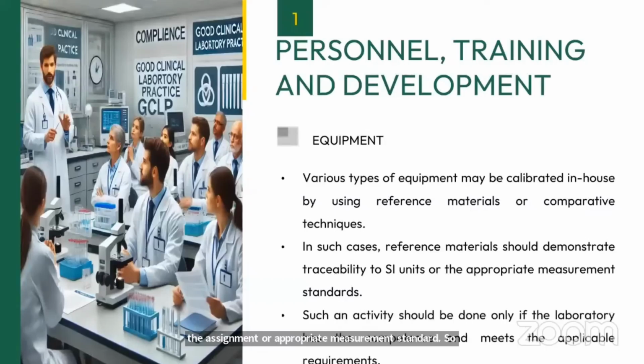Such an activity should be done only if the laboratory has the competence. You should calibrate only if you know the actual protocols and you are competent to perform the calibration. Then only should you take it up and perform the calibration of your equipment. Otherwise, it is absolutely no to performing any equipment calibration in house in your laboratory.